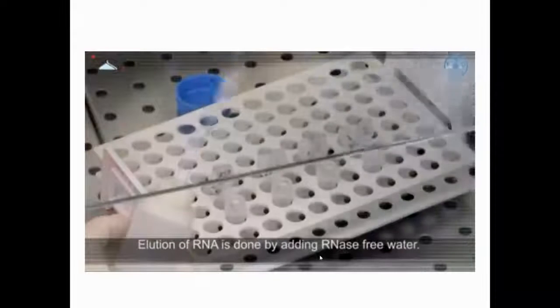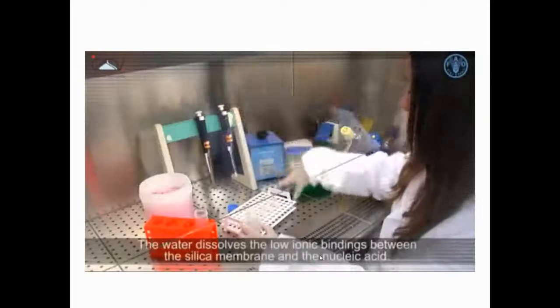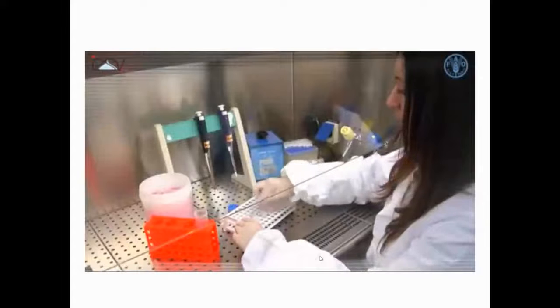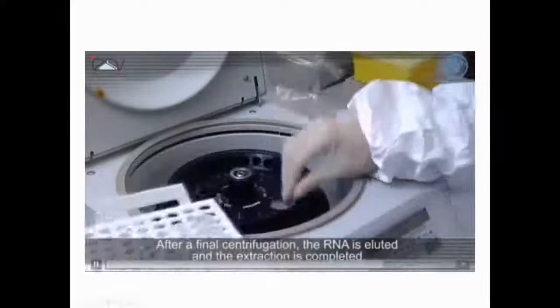Elution of RNA is done by adding RNase-free water. The water dissolves the low ionic binding between the silica membrane and the nucleic acid. After a final centrifugation, the RNA is eluted and the extraction is completed.